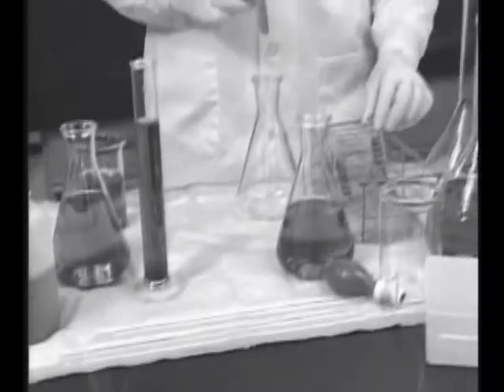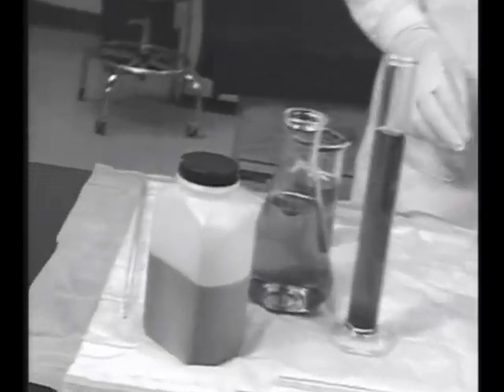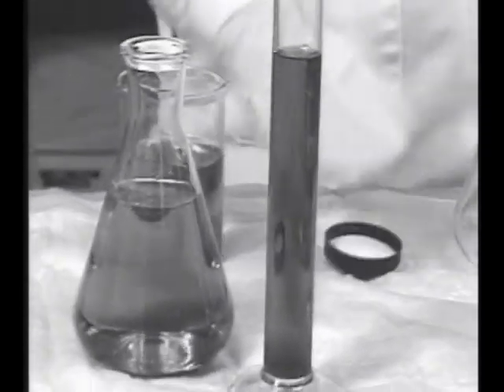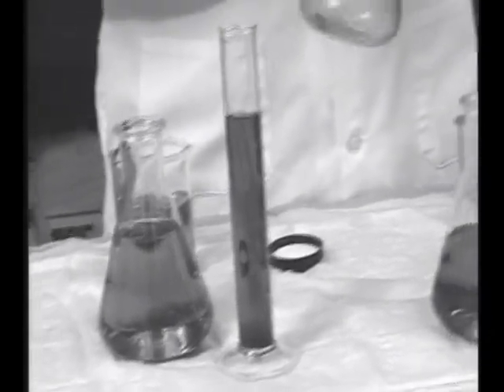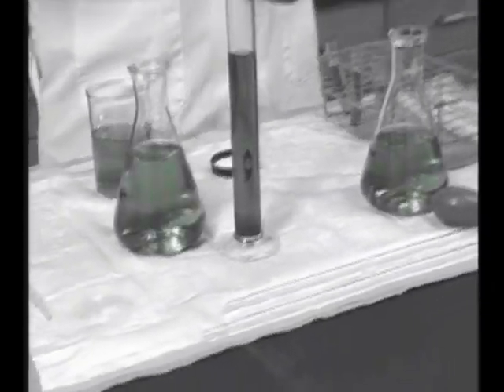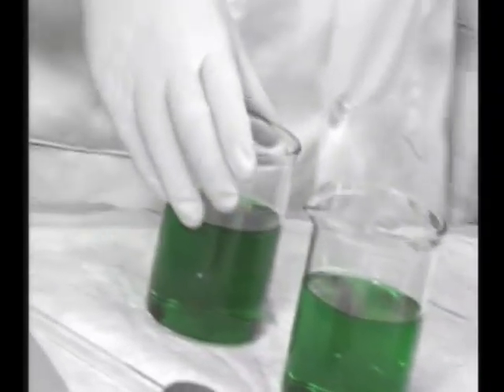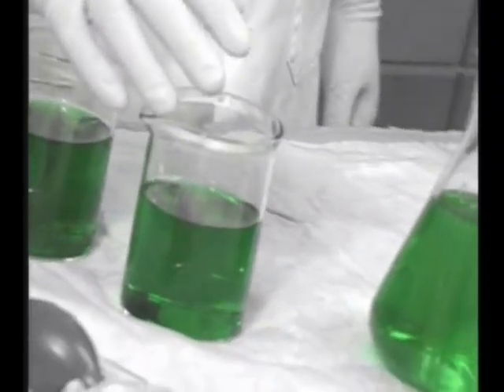Imagine, if you will, a laboratory where all of the chemical containers have no labels, where all of the measuring tools and vessels have no markings, and where all of the chemicals are the same color. There would be no way to tell which chemicals you are using.